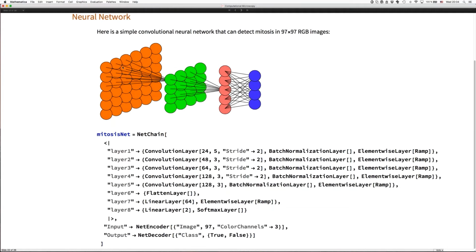In essence, a neuron in the second layer collects all the activity in the previous layer. It basically collects the activities, like a convolution. Then I may want to normalize the activity to avoid spikes that go beyond the range of what's reasonable.